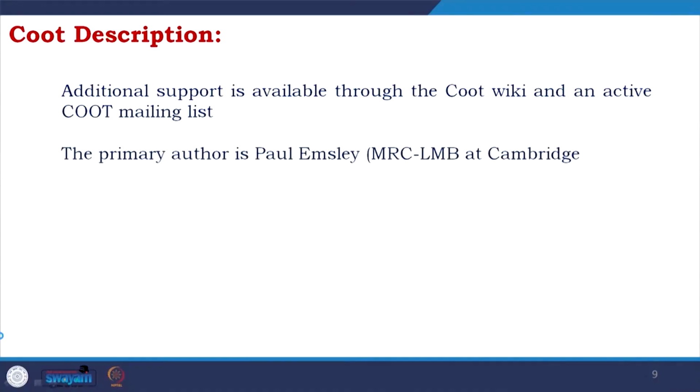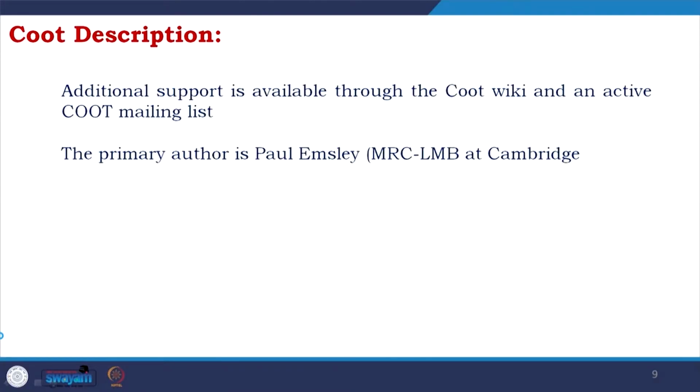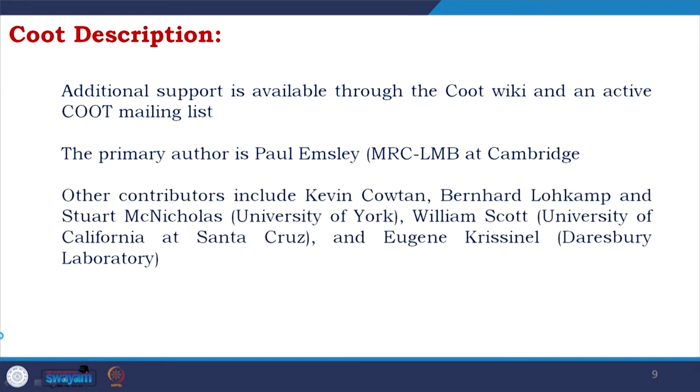Also, if you are part of the mailing list, you will see other users, new users like you, facing problems, which will be good for you to learn things which you don't think of or don't face yourself, but others are facing. So, it is good to be part of the COOT mailing list. As I told, the primary author is Paul Emsley. Other contributors include Kevin Cowtan, Bernhard Lohkamp and Stuart McNicholas, University of York, William Scott, University of California at Santa Cruz, and Eugene Krissinel, Daresbury Laboratory.